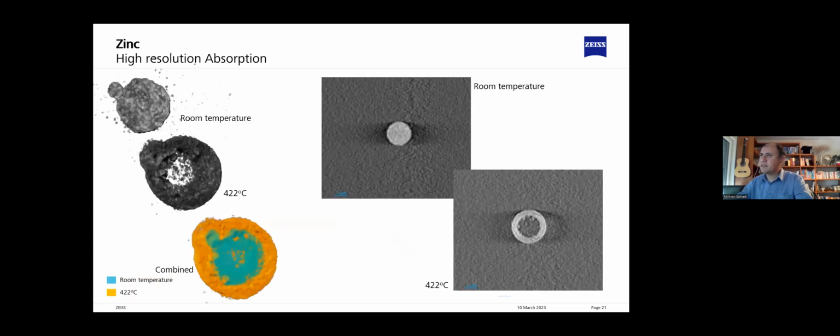An example of that is zinc powder particles, which we started to heat from room temperature up to certain hours. We watched them in 2D, and then we performed a scan in 3D, and this helped a lot in selecting a time at which the nanowires are perfectly formed, and one could see at which temperature and which times they are formed. Later it is possible to perform a full 3D scan, perhaps once the sample is cooled down, to have the 3D information, or even at higher temperatures if the sample is stable enough.